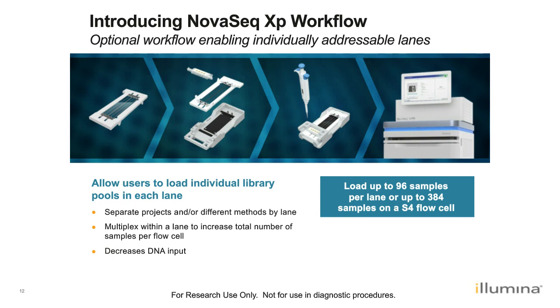So some of you may have seen the release about the new NovaSeq 1.5 reagents that are coupled with our new control software version 1.7. These were released a couple of weeks ago. The V1.5 reagents do require the new control software version 1.7, but this new control software version is compatible with both the current V1 reagents and the new V1.5.